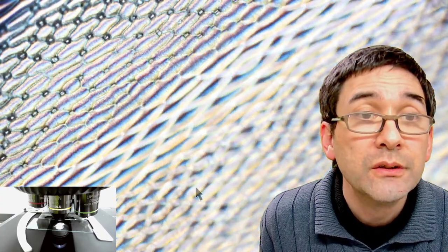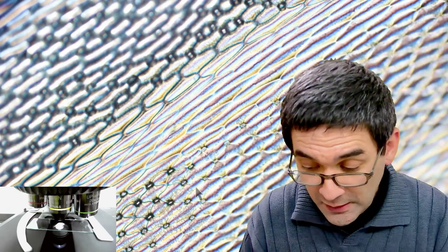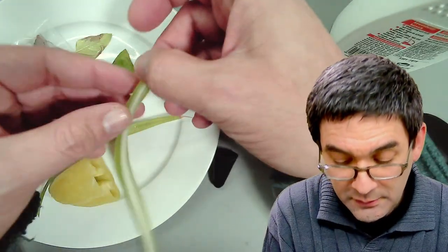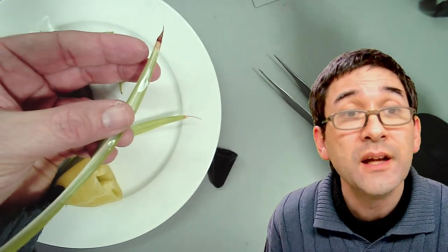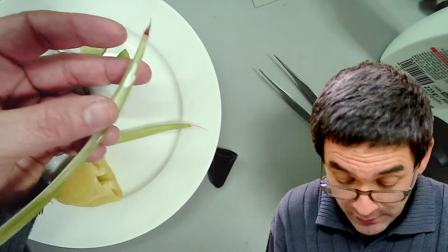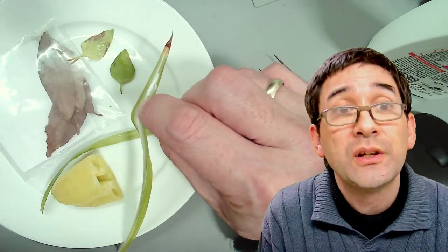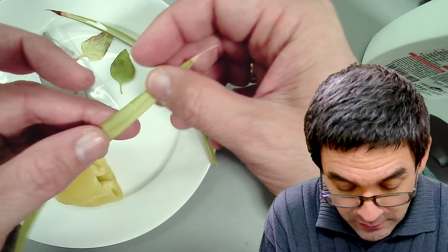The nice thing about this glue method is that it allows you very easily to actually see the structure of the cells of the leaf without actually having to prepare the leaf itself — preparing it in such a way is not so easy because you have to make a very thin cut. But the glue carries the structure quite well. I think it looks kind of nice and also artistic. All I have done is taken some of this white glue and simply added it on here, then waited until it's dry.